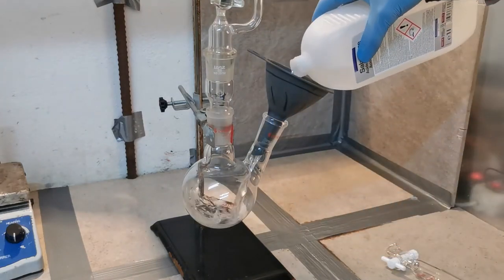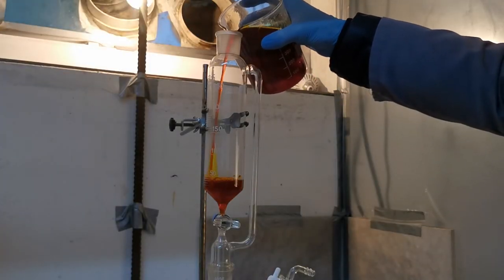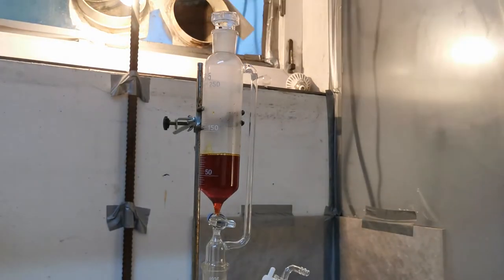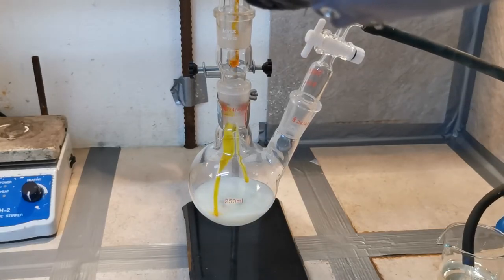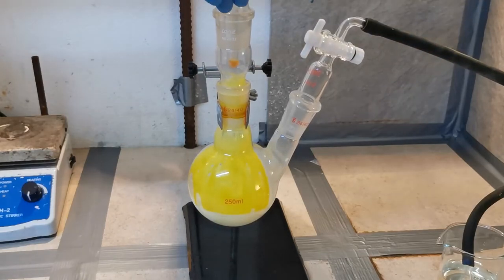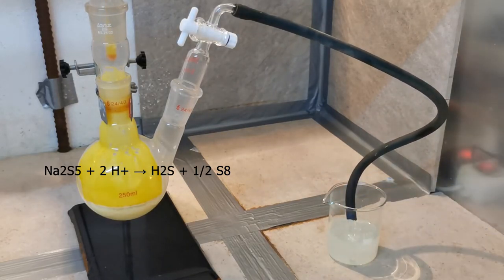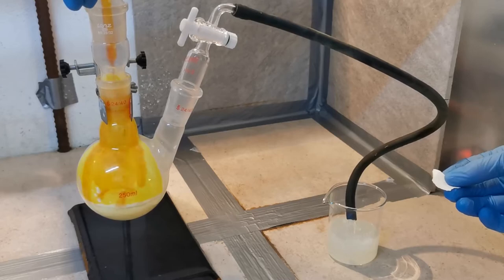Now I filled the flask with hydrochloric acid and put the polysulfide solution in the addition funnel. This way, once you're done and some is left, it can simply go back to storage without being contaminated with anything. Upon addition to the HCl, hydrogen sulfide was evolved, and the bleach solution in which the gas was led quickly turned opaque, due to the oxidation back to elemental sulfur. I can also test for its presence with some lead acetate paper, which as you can see quickly turns black.